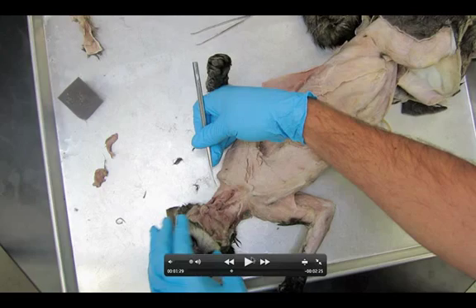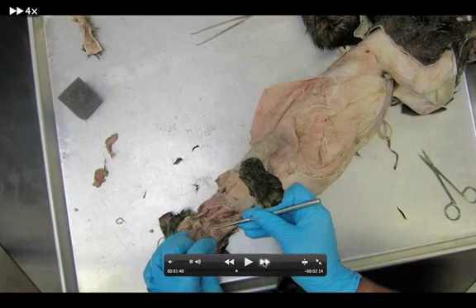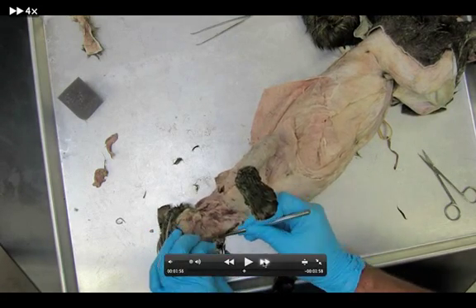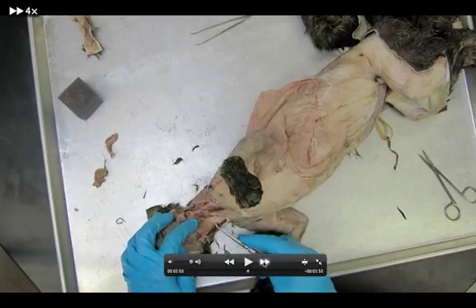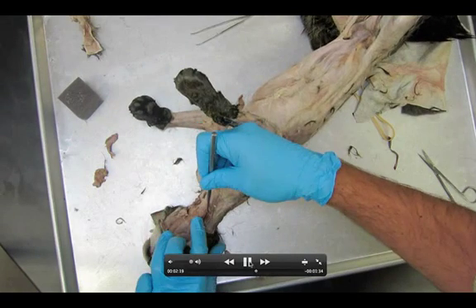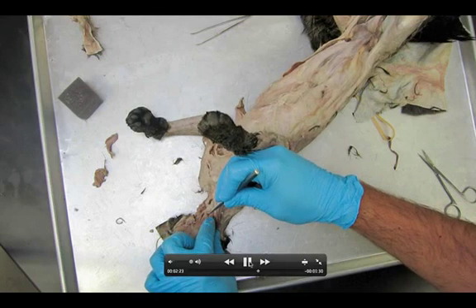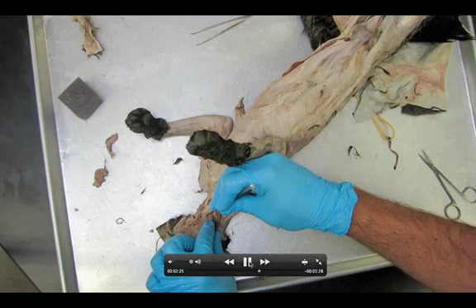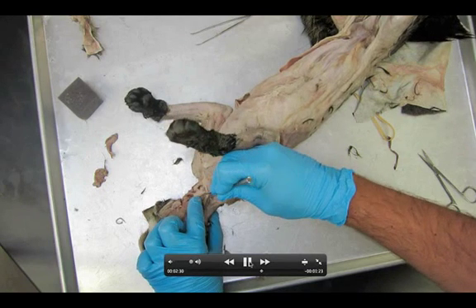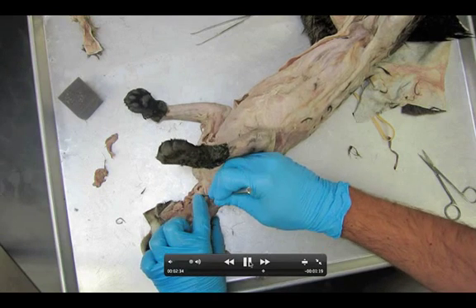Let's finish up this dissection. On the one side, wherever they drained the fluid from your kitty cat, you'll be able to see the trachea. I'm right there, underneath the sternohyoid, getting my probe under it. I'm just lifting them up, and then you're actually going to be able to see — you should be able to see the trachea, and behind the trachea is the esophagus.